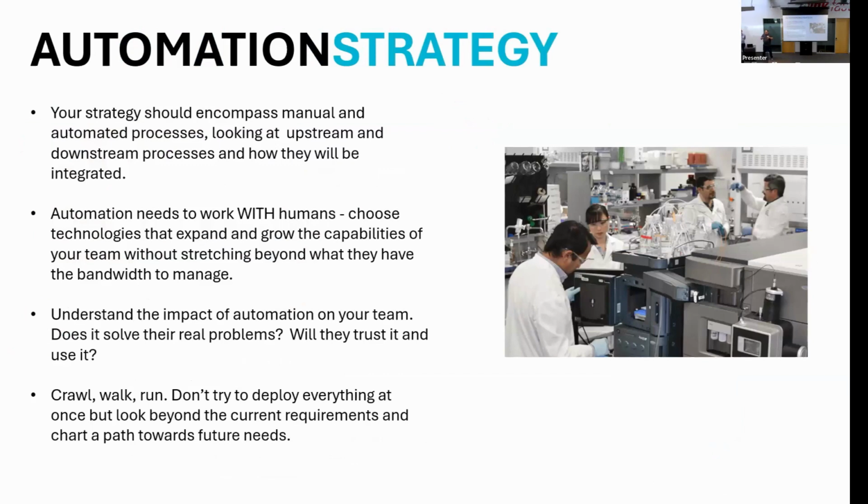Again, you might be faced with a problem of throughput. I need to process more plates every day than I can do right now. But you can't think of that as an isolated problem. You have to think about the upstream and the downstream processes. What happens all of a sudden when you need to standardize on a piece of labware for an automated process? How does that impact the team that's supplying you samples and the team that's taking those samples downstream of you? So think about it in context.